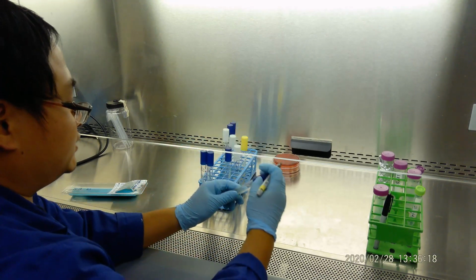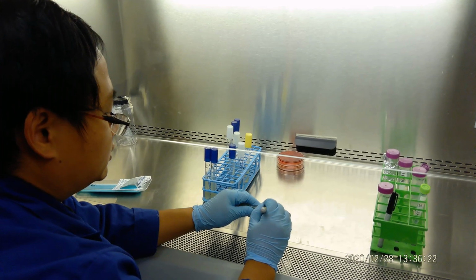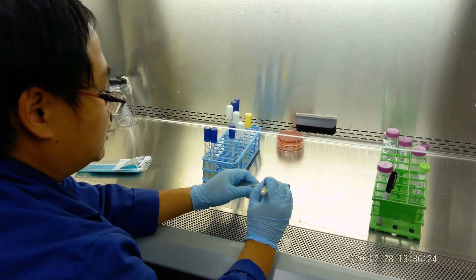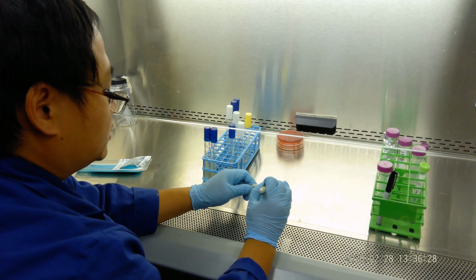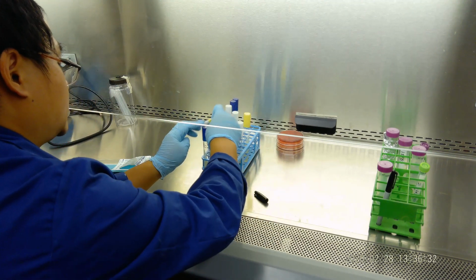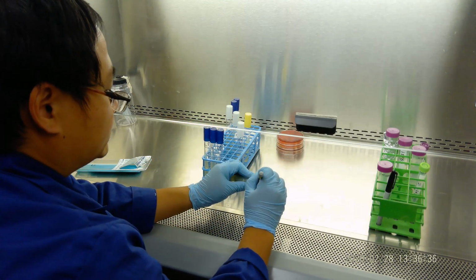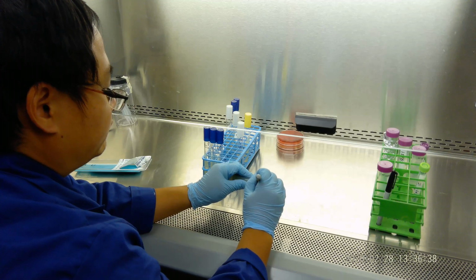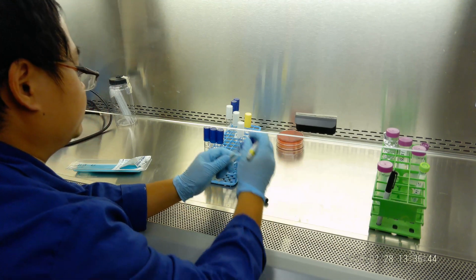Then we do 37 degrees Celsius, E. coli, 37 degrees Celsius, initial, date. Okay. Then the last one we put at 55 degrees Celsius: E. coli, 55 degrees Celsius, initial, date, and bench number.